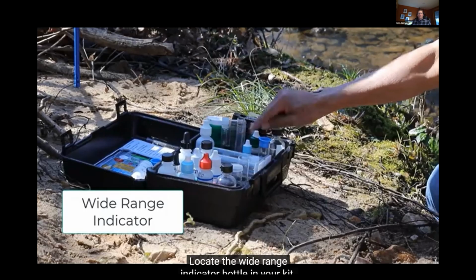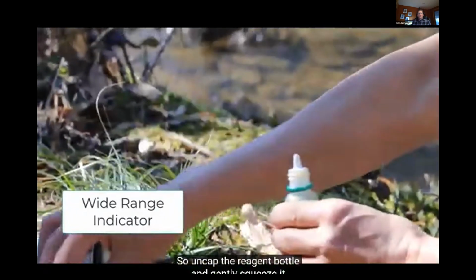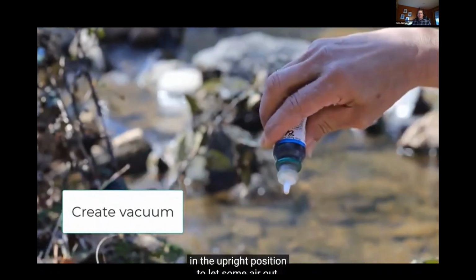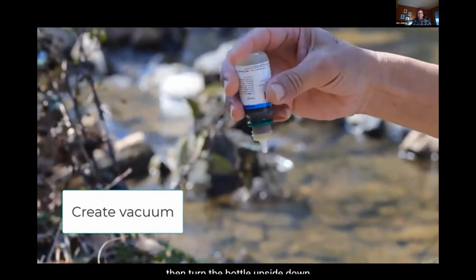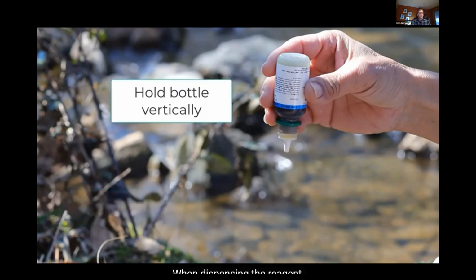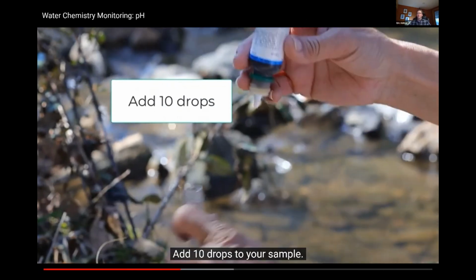Locate the wide range indicator bottle in your kit. This bottle has a built-in dropper, so uncap the reagent bottle and gently squeeze it in the upright position to let some air out. Then turn the bottle upside down while releasing the pressure. This creates a vacuum inside the bottle that allows for more control to dispense drops and avoid excessive dripping. When dispensing the reagent, take care to hold the dropper bottle vertically. This ensures uniform size drops. Add 10 drops to your sample.